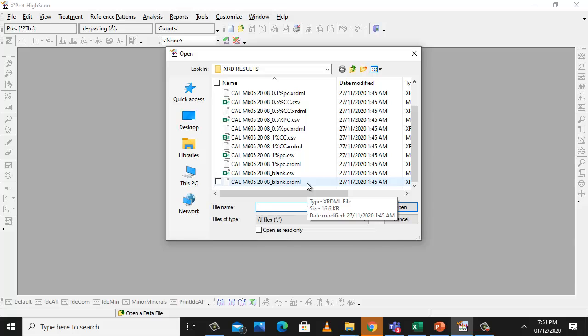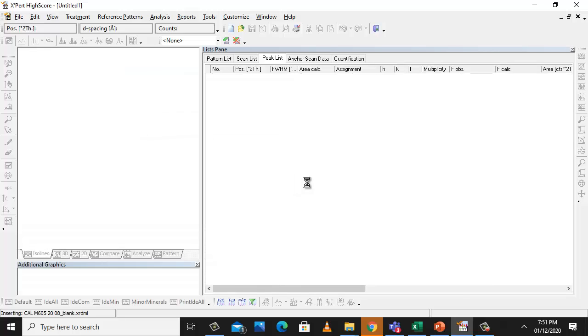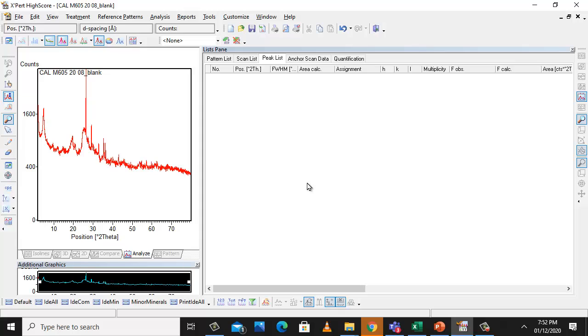For example, right now I have a wet drilling mud sample, and I'm just going to run the file, and this is how an XRD plot of that particular drilling mud will look. You don't have to do anything, just three simple basic steps to do the curve fitting, because these 2 theta values and intensity values make up the graph, and 2 theta values are independent. It means these are the 2 theta values that we provide, and in terms of dependent values we get the counts or intensity values. But the thing that we need to use the software for is the curve fitting. We need to do the curve fitting to find the exact value of 2 thetas corresponding to the type of minerals that we want to identify.